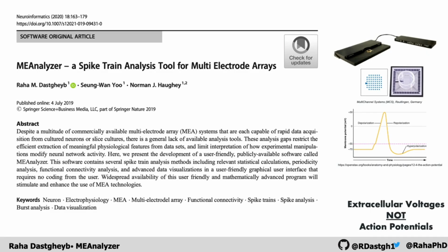And even if you are a coder, then you know that encapsulating software into functions is one of the central tenets of reproducibility. So here we've created a piece of software with a graphical user interface that allows everyone to easily and reproducibly analyze and visualize spike train data. The visualization part is especially important because it allows you to make observations to guide analysis of current experiments, design future experiments, and question your assumptions for things like analysis parameters.